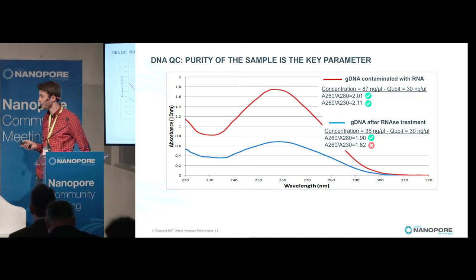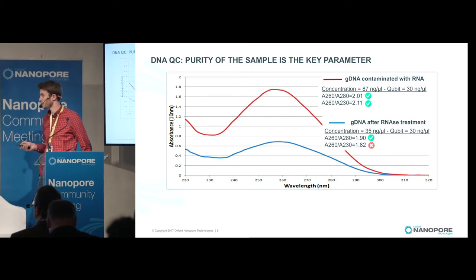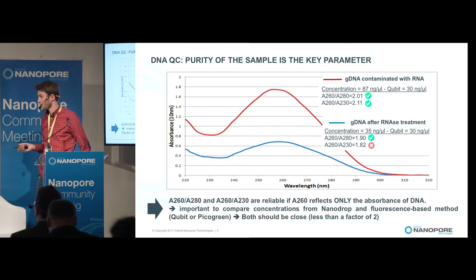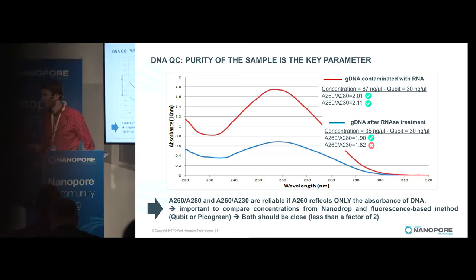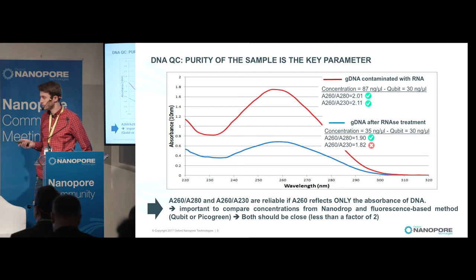Here is an example of gDNA contaminated with RNA. The two ratios look good, but there is a big shift between the Nanodrop and the Qubit concentration. After RNase treatment, the two concentrations become very close, but the 230 ratio is no longer good. So it is very important to have good ratios, but also to have a close concentration between the Nanodrop and a fluorescence-based method like the Qubit or PicoGreen, with a factor less than two.